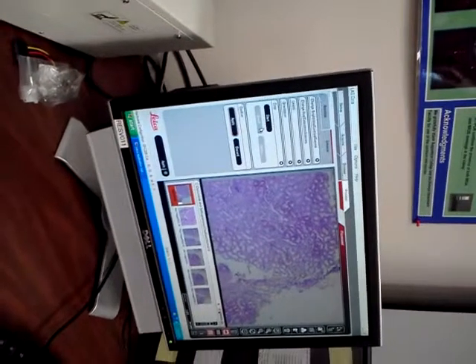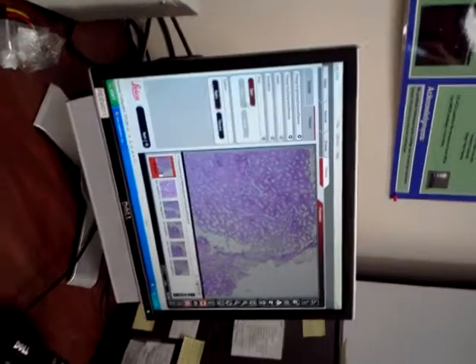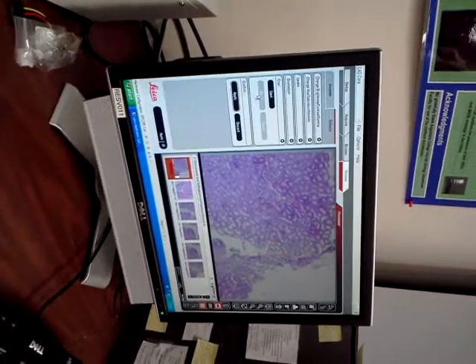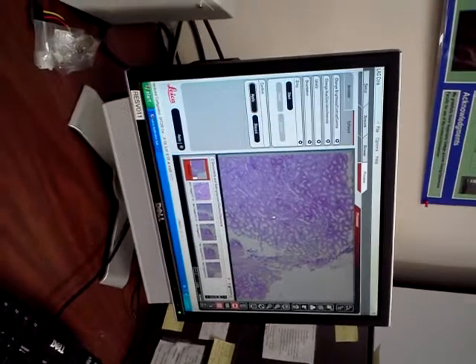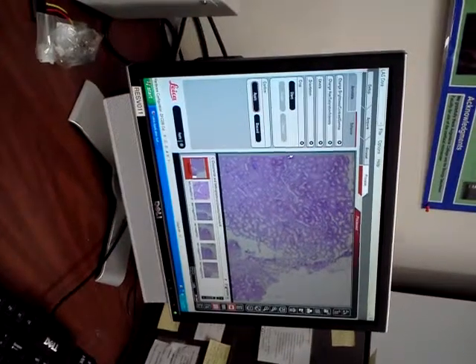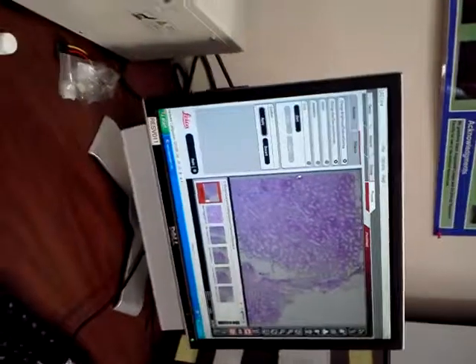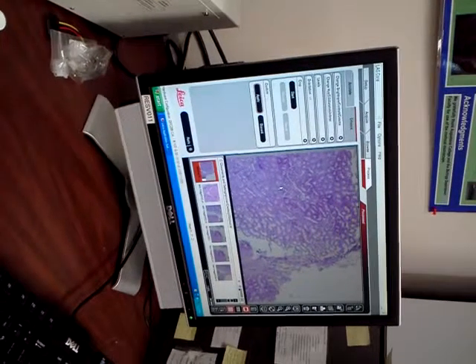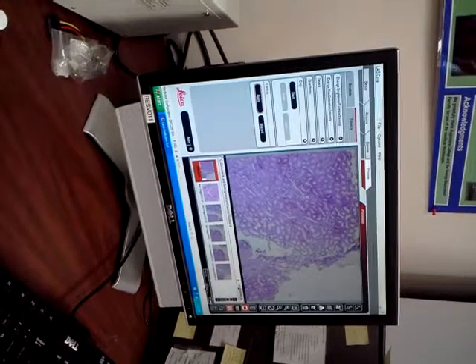From here, you could zoom in, and you're not losing any resolution. And when you stitch, you still have the option to do size bars and all that stuff. It knows what it is. It does. Yes. So that's kind of a quick little walkthrough for you guys.